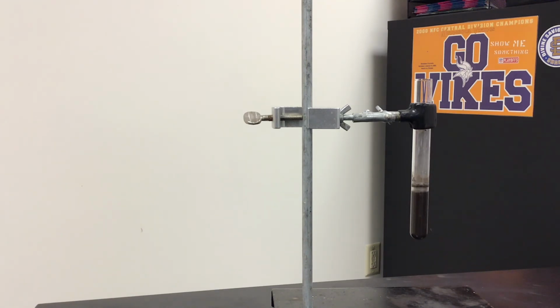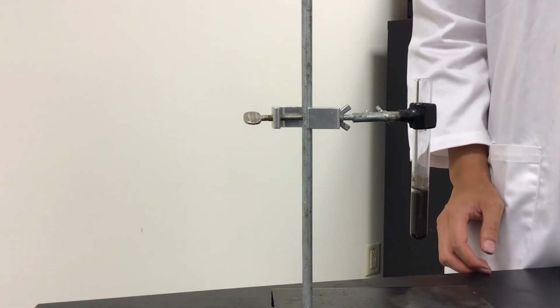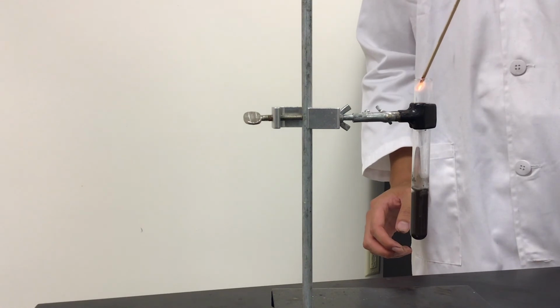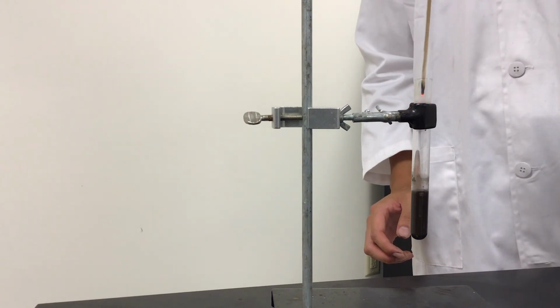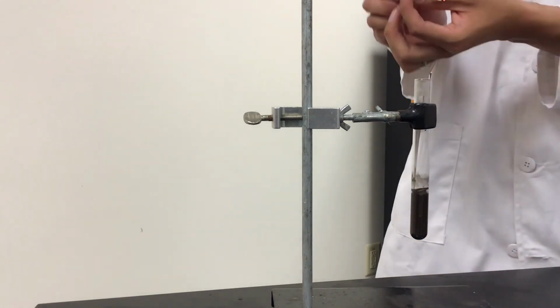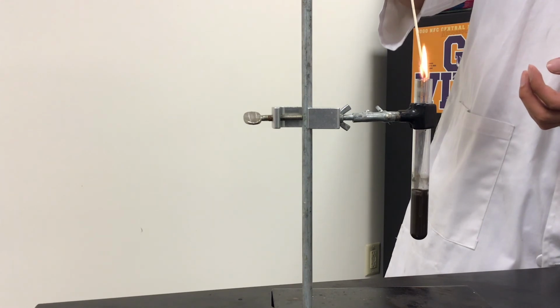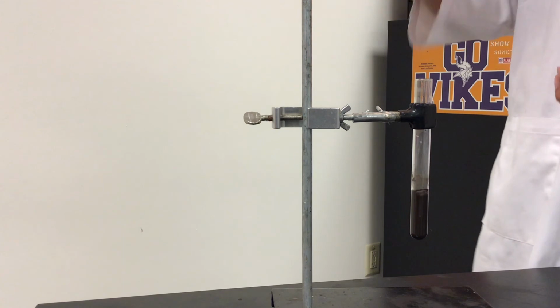I'll light up the wooden stick and gently blow on it so there's not an open flame, and put it in the test tube. If it's oxygen, it's going to help it relight. As you can see, it started relighting a bit, but here you go. So that identifies it as oxygen.